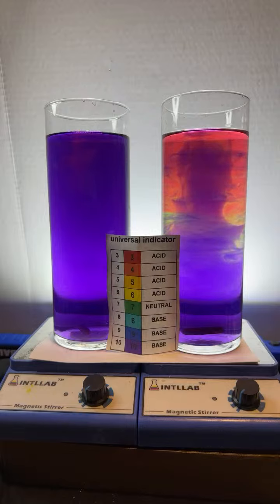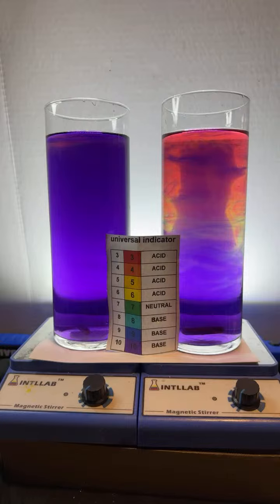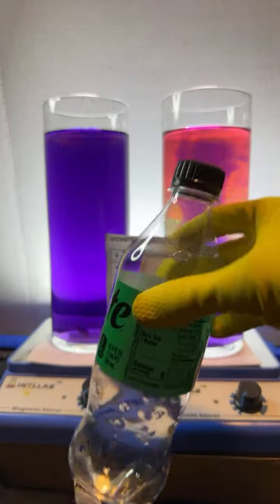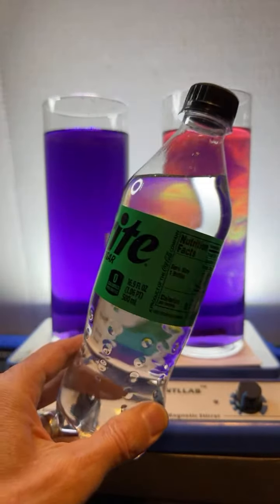Someone says Sprite is an acid. I actually have some Sprite. Hold on a sec, we'll test it for you, okay? Give me a second, I'll get it. And we'll test it. All right. Here we go. So I've got some Sprite Zero here, never been opened. All right, and we're going to go ahead and test this with the universal indicator, okay?